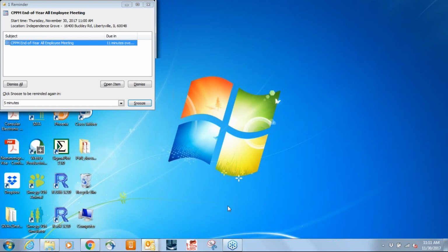Yeah, if you have a model that's built for USP2, theoretically the solubilities, the release rates and everything could be moved to the USP4, and based on the flows and the concentration gradients produced in that experiment, we can calculate that. Presumably, if the differences in release are just based on those concentration gradients and differences in fluid velocity in the two experiments, the model should help predict that when you translate.